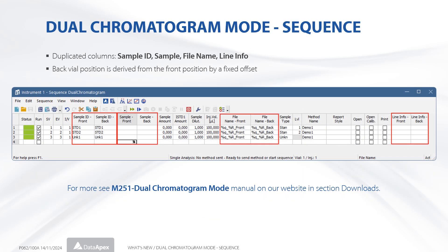In the sequence table, many columns have been duplicated so that you can input different values for the front and back positions. The position of the back vial is derived from the front position by a fixed offset specified in the method. For more information about dual chromatogram mode, please refer to the M251 manual.